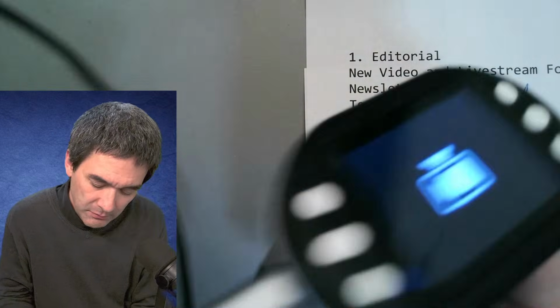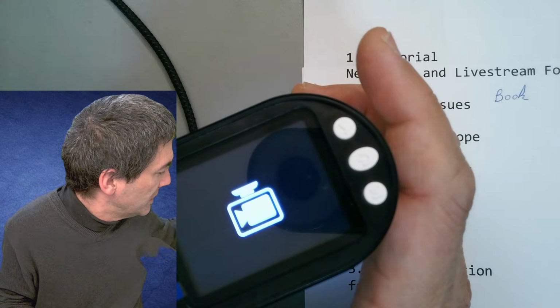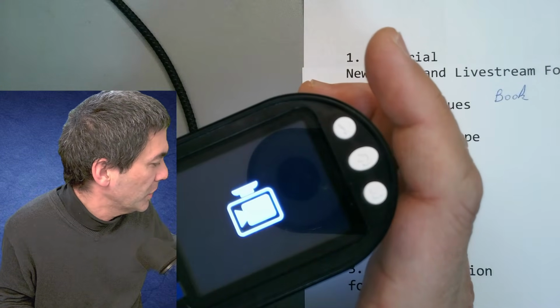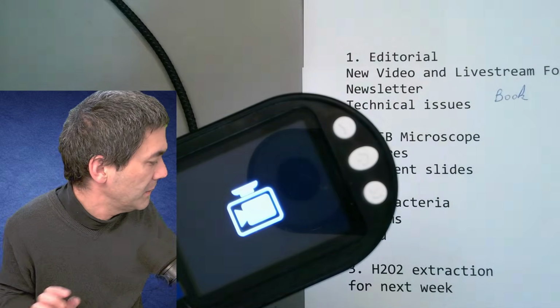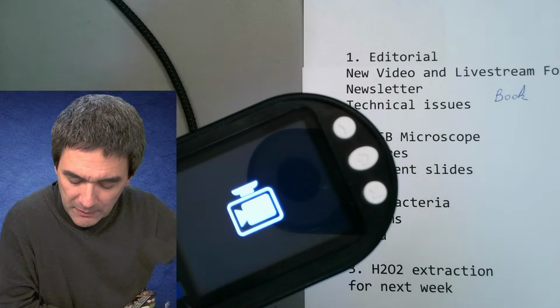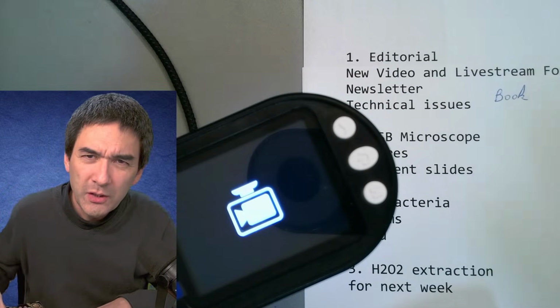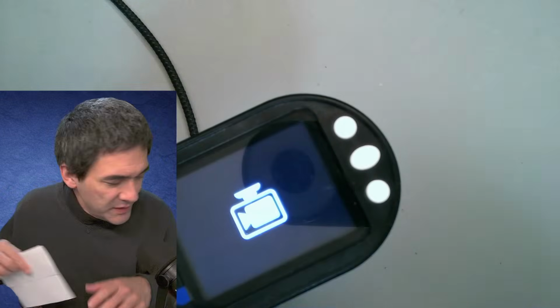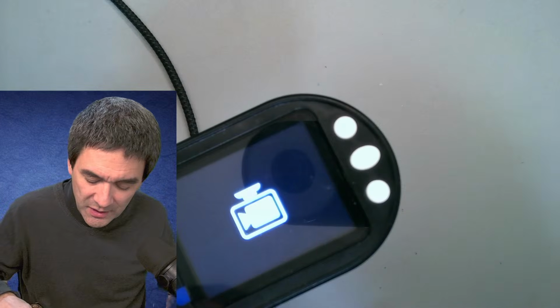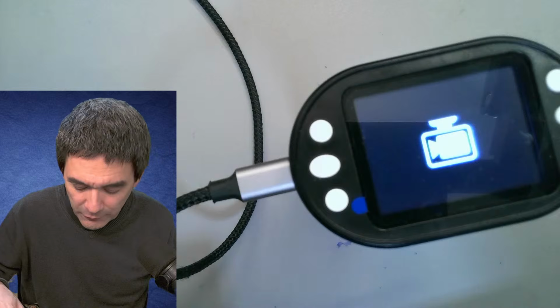And then I'm just going to show you the box as well. What I consider kind of remarkable is that it came in a very fancy package, but it's marketed towards children. Why do you want to market this to children? And I think the reason is because the manufacturers themselves actually knew that this is not entirely flawless.